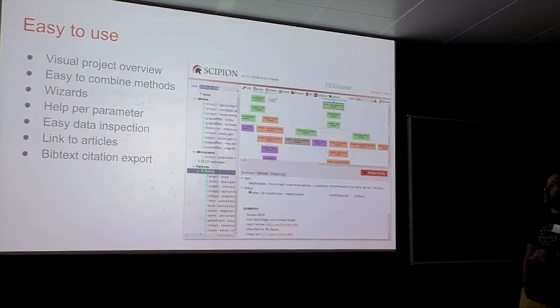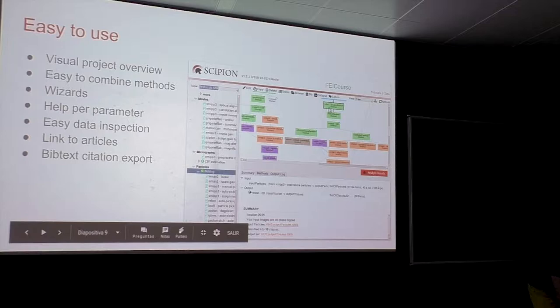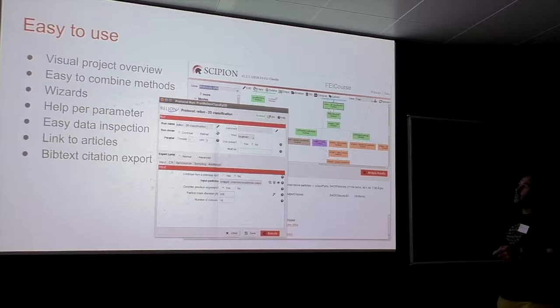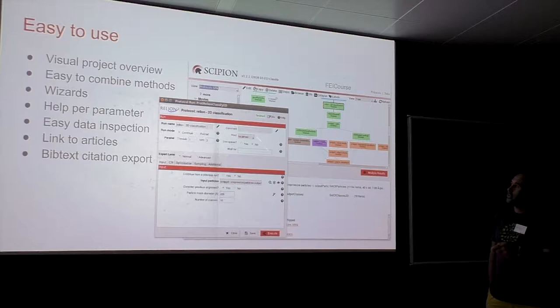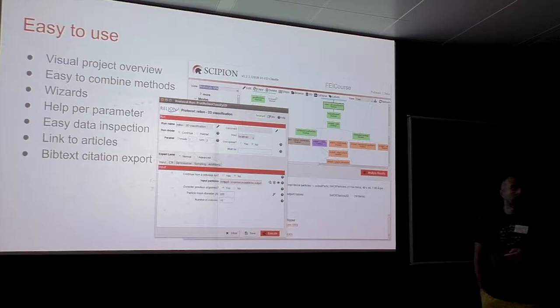You have a list of all available methods you can use. You're presented with a summary of what is selected — for Relion 2D classification, for example, you see a summary of input, output, and results. When you click on one of these boxes, you see the parameters for that specific step — a general section common to all boxes, and a specific section for the 2D classification parameters.